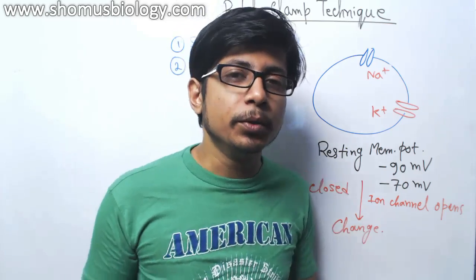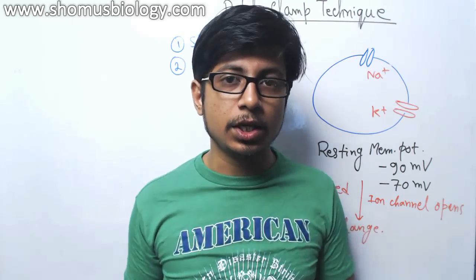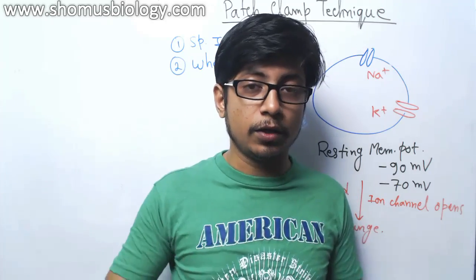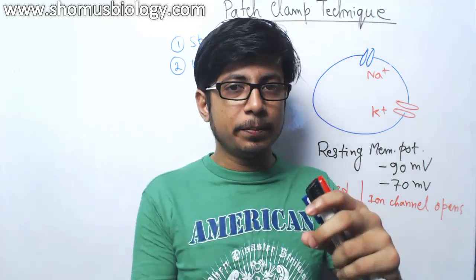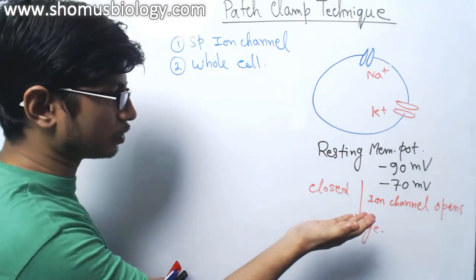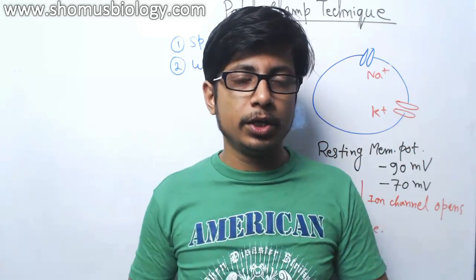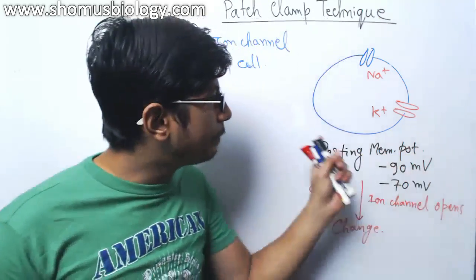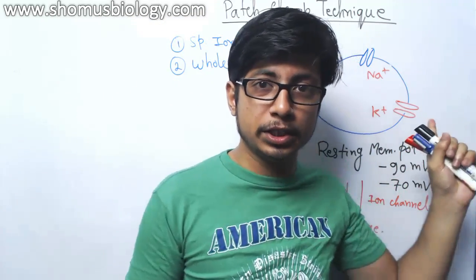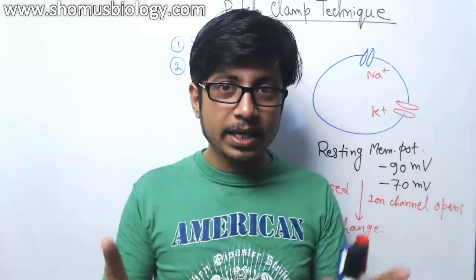For that, we take a tissue slice, or usually we use cell culture, animal cell culture. For example, we are looking at the same situation in a mouse neuron. We take the culture of these neuron cells in a plate and put it under a microscope. Those cells are tiny, we cannot see them separately. Once we look at cells in the microscope, you will see all the cells clustered together. But we want to study a separated cell. We need a complete unit cell, not attached to any other cells, to measure this whole process. So another important thing is that we need to find an isolated cell in that plate.